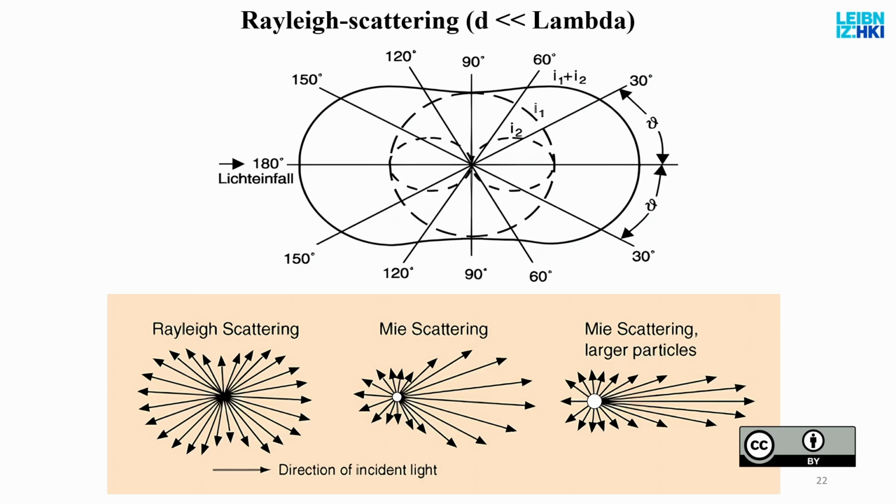Before you draw a conclusion of, okay, these proteins co-localize, if you label them differently, is there a chromatic aberration? How do I check it? And if you are analyzing your own images, which hopefully you will after the class, you have to know how to compensate, how to shift images to make up for the shift caused by the lens itself.